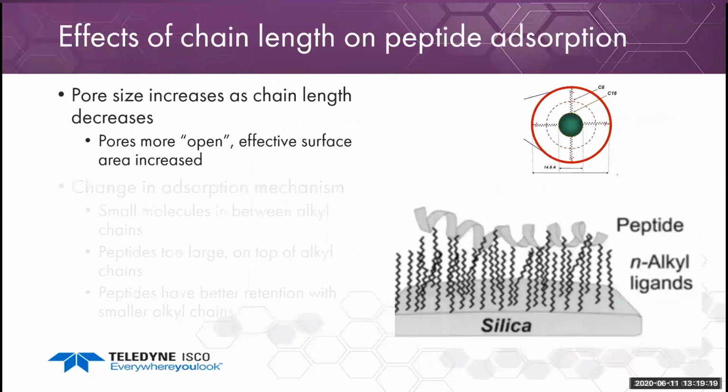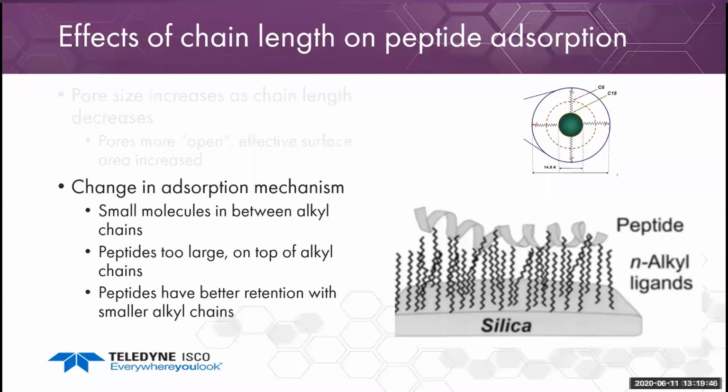The pore size for silica-based columns is measured prior to modification. This is denoted by the red circle. C18 has the smallest pores after the alkyl phase is bonded. The pore is partially closed as depicted by the small circle. The C8 opening is larger than the C18 pore. Even with similar silica pore sizes, this makes C8 bonded phase columns more accessible to large molecules.